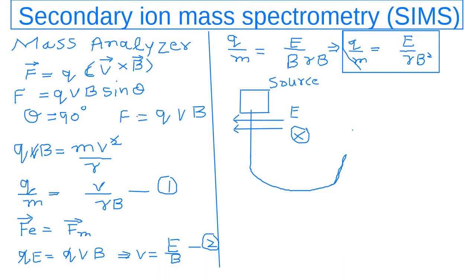So what will happen in this case is the trajectory. For example, if you would like to come across this one, what would be the trajectory in this case? What would be the radius of curvature of this one? So this will be the value of R in this case. Then, if you look into the details, let's say that I am plotting it here. I have two blocks over here, and somewhere here I would have the detector. The situation should be a bit clearer in our mind.